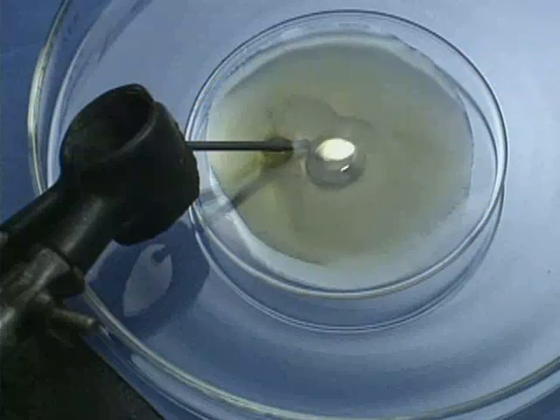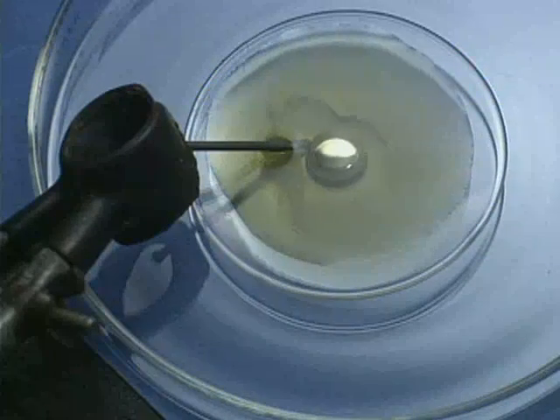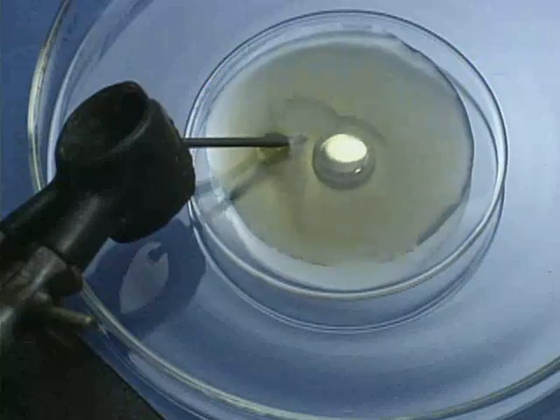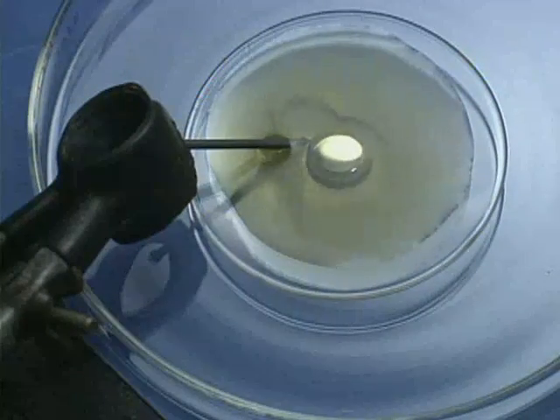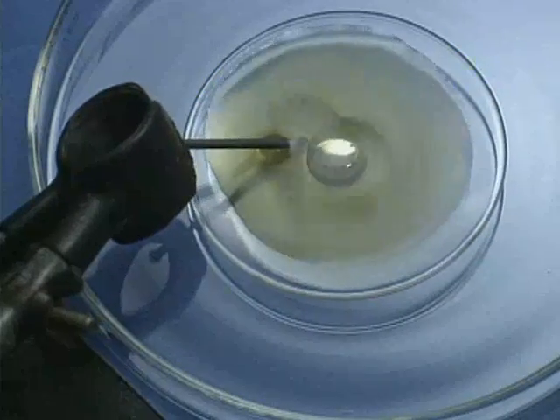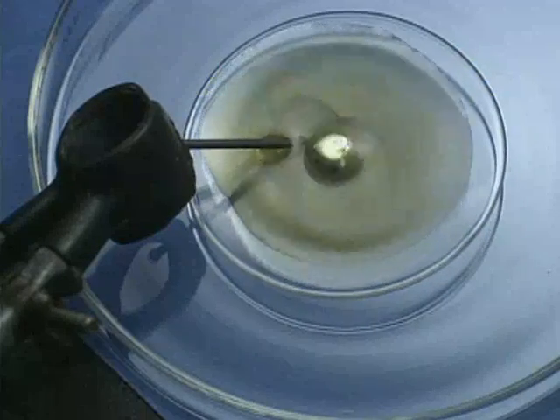A solution of potassium dichromate and dilute sulfuric acid covers a drop of mercury in a watch glass. An iron nail is positioned so that it nearly touches the mercury. Eventually, the mercury drop starts to beat rhythmically, like a beating heart.